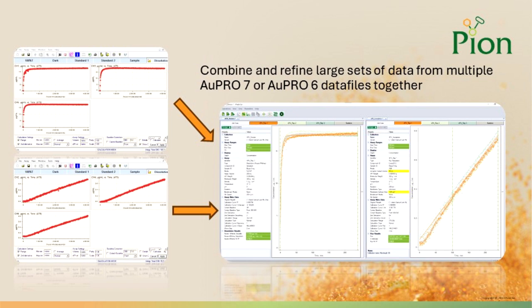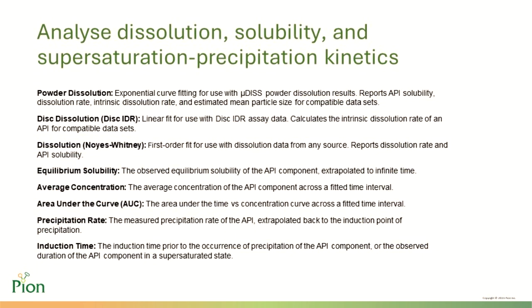The data module will also automatically calculate average values for fitted data and produce average profiles whenever multiple data sets are included. A broad range of data analysis options are currently available in the data module, including options for powder and disk dissolution assays, solubility assays, supersaturation precipitation studies, or whole dosage form dissolution assays. More general functions for running calculations to find the area under the curve data, or simply the concentration over a selected time range, are also included.